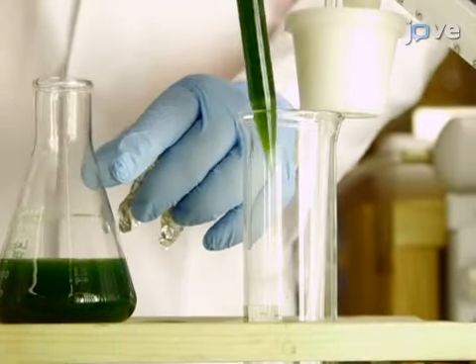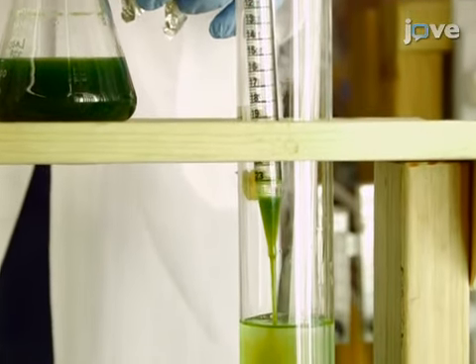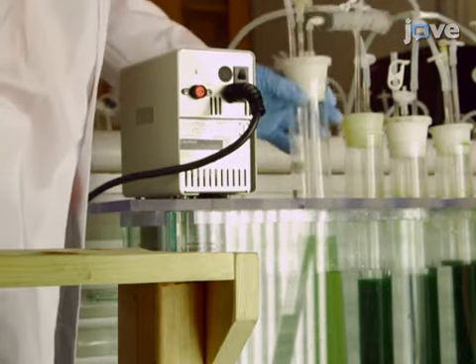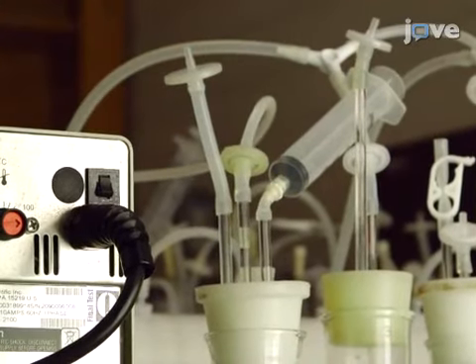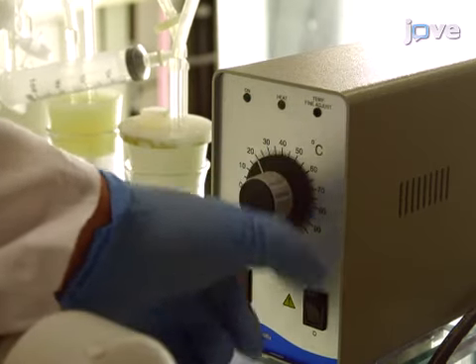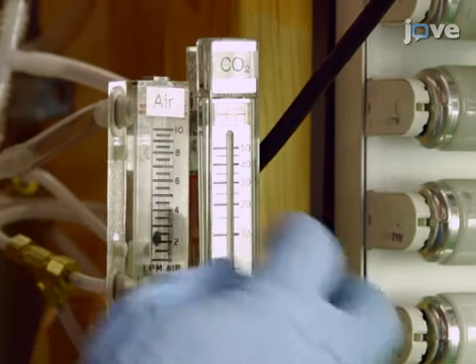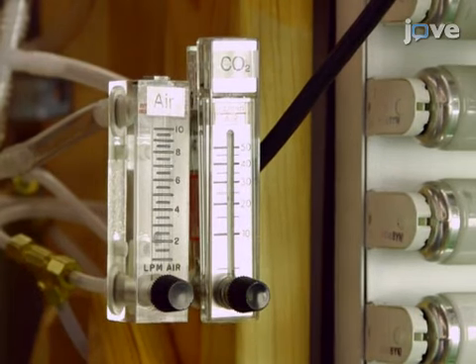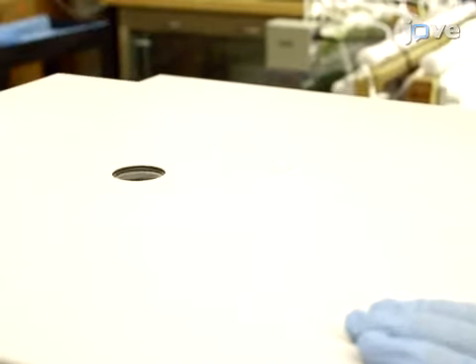Transfer the microalgae to a 1.1-liter sterile photobioreactor, or PBR. Place the PBR in an inoculum water bath illuminated at 200 micromoles per meter square per second with T8 fluorescent lights, and use a recirculating chiller and automated heating recirculating water bath control to maintain at 23 degrees Celsius. Adjust the air and carbon dioxide rotameters to 2.5 liters per minute and 25 cubic centimeters per minute, respectively. Grow and harvest the microalgae according to the text protocol.